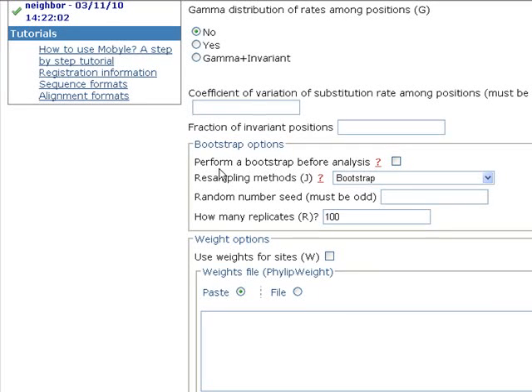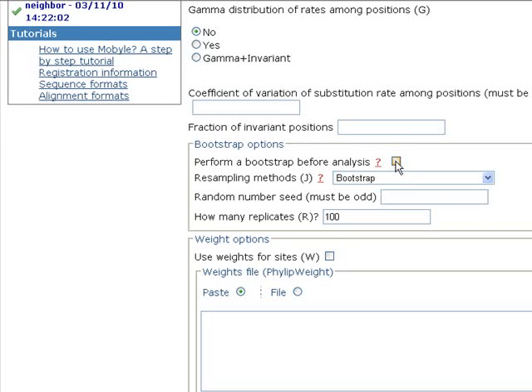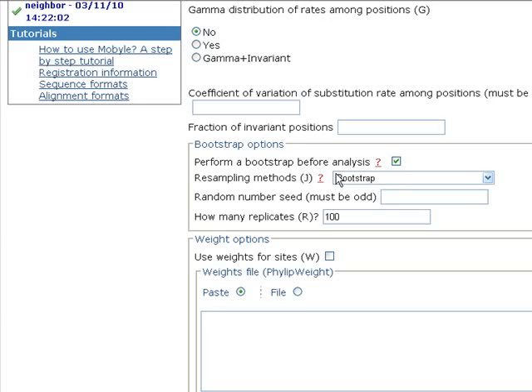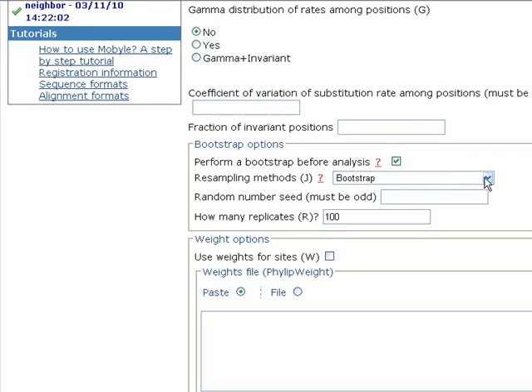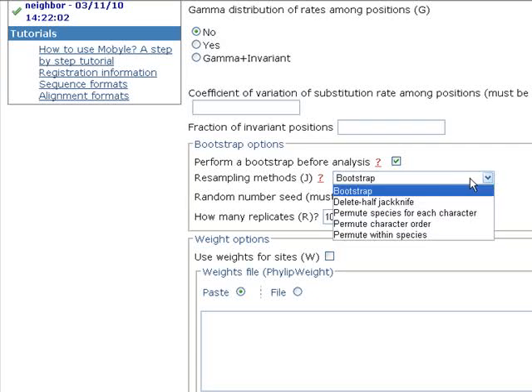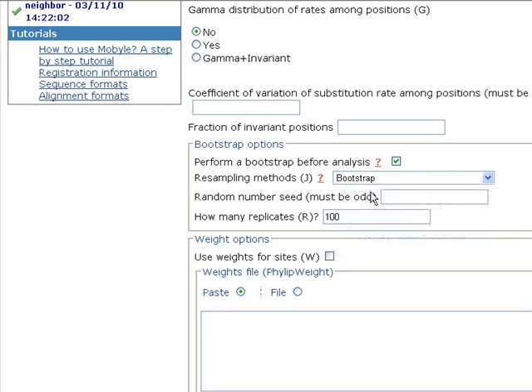So here in perform a bootstrap before analysis, we can check this to perform a bootstrap before analysis, of course.